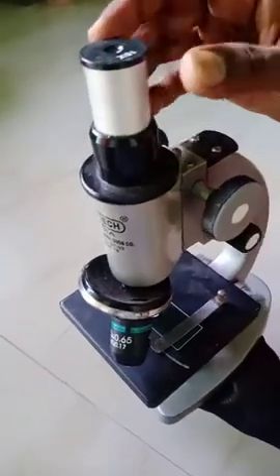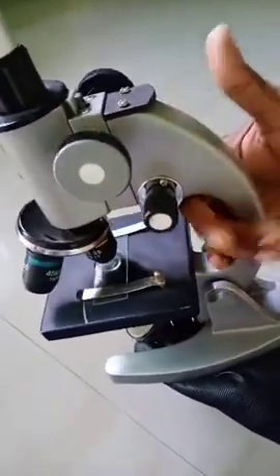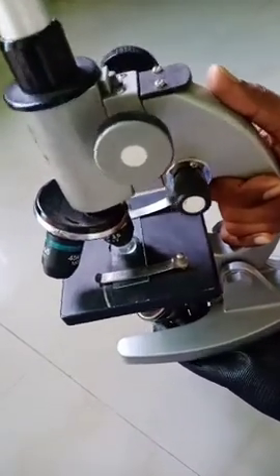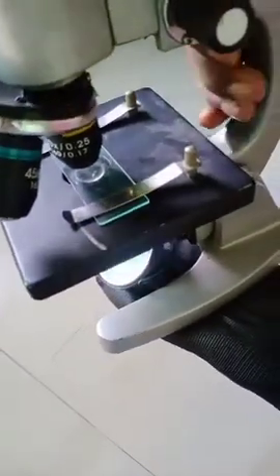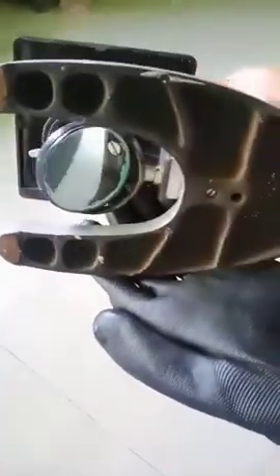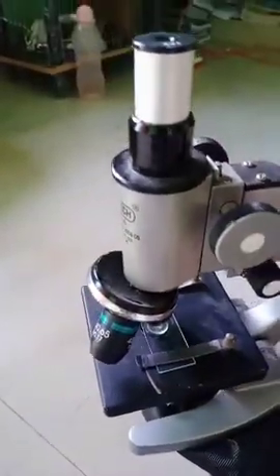Let me go for the basics of the microscope. So this is the structure of the microscope. Here I have held this microscope. This part is called the handle. This handle is helpful for lifting the microscope, and I have kept the microscope on my hand palm. Here, this is known as the foot. This is responsible for placing or adjusting the microscope on a particular surface.